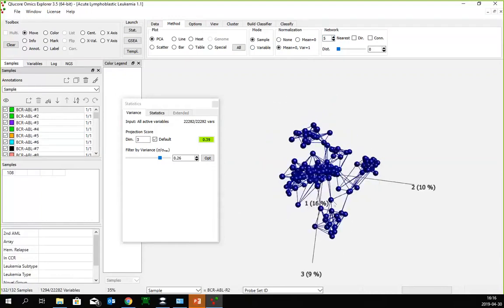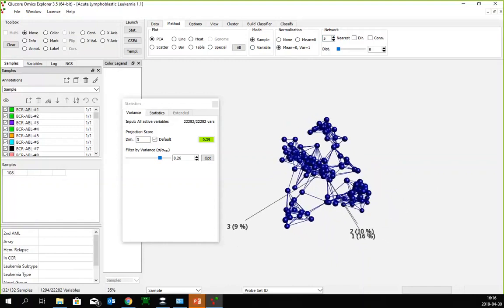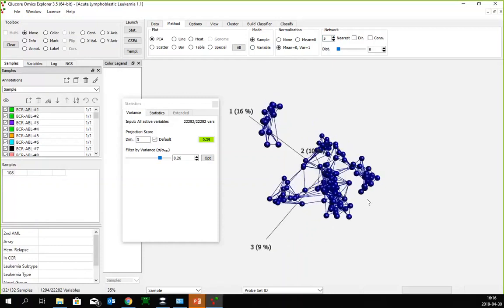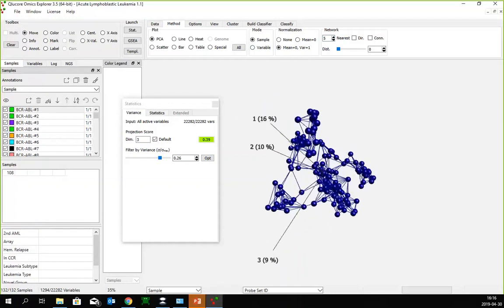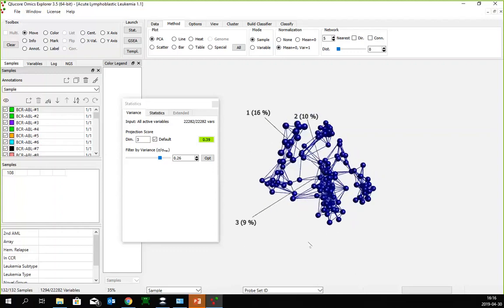And as you see, there are very few connections between, let's see here, this subcluster here and the other subcluster. So you can sort of see on the graph here that the big group forms subclusters here, and that gives me a strong indication that there might be more groups in it. So that's the next tool you can use.